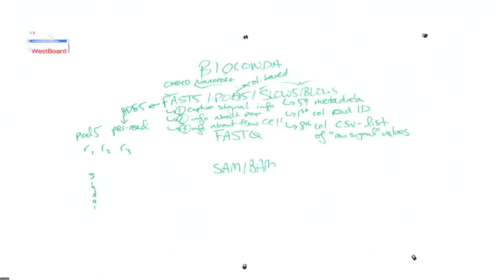And typically we have tools such as Bioconda to install all of these package programs. In a classical analysis pipeline, we take the FAST5, BLOW5, SLOW5 signals, convert them to FASTQ, and then we use an alignment program to convert the FASTQ to SAM-BAM. Typically, the pipeline will keep going if we're interested in epitranscriptomics with a program called F5C, which allows basically for a connection between these alignments and their raw signals. So that's the role of F5C.